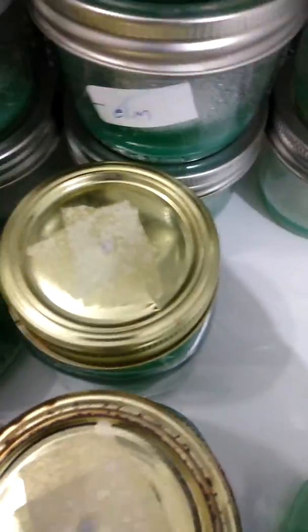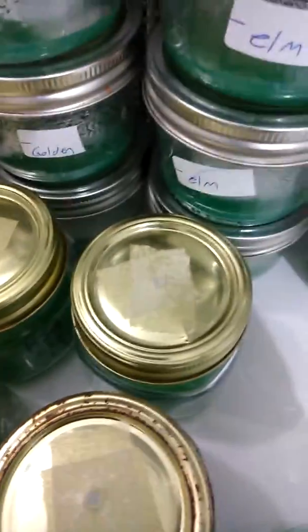While we always pull from the leading edge, that way you know you're not pulling mycelium from an area that was dirty. Say I'm going to transfer from a dirty plate. I'm going to put the wedge right in the middle of the plate, so that's dirty, right? And it's going to grow out circular. And I'm going to take a wedge off of that with the intention of it being clean.